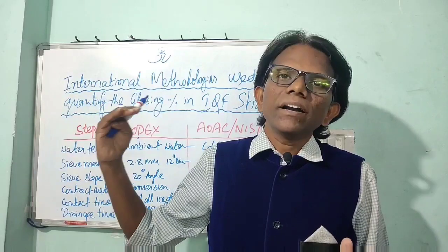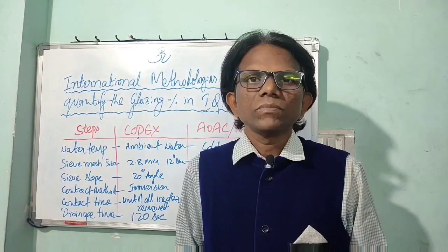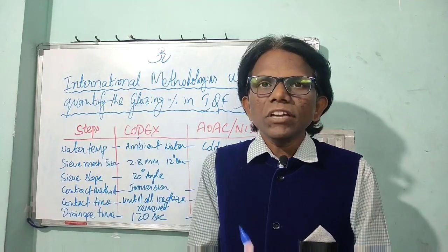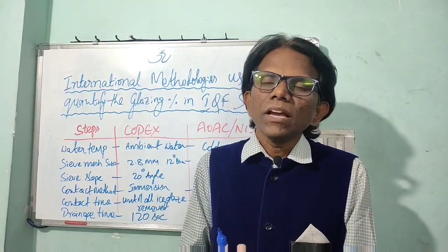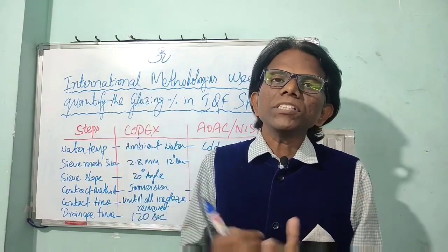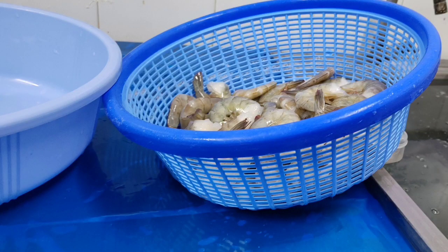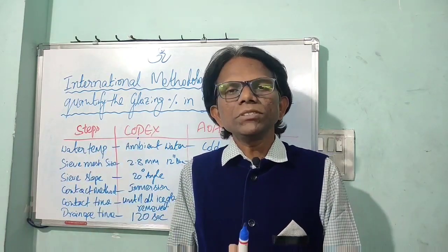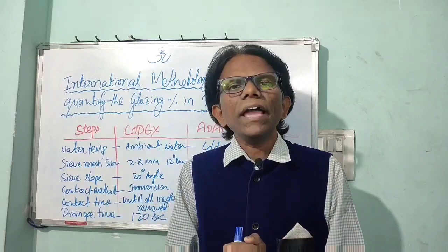The Codex method checks the deglazed weight of the shrimps to quantify glazing percentage in IQF frozen shrimps. First we need equipment: a calibrated balance with calibrated weights, a receiving pan, and a drain mesh sieve. In the AOAC method, an 8-inch mesh sieve is standard, but this has been amended to a 12-inch diameter mesh sieve, which is advisable when checking glazing percentage for more than 1 lb of IQF frozen shrimps.